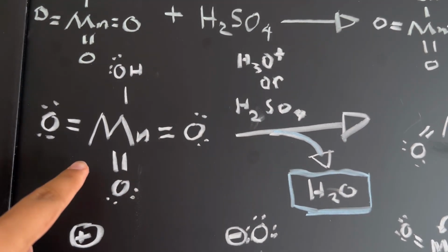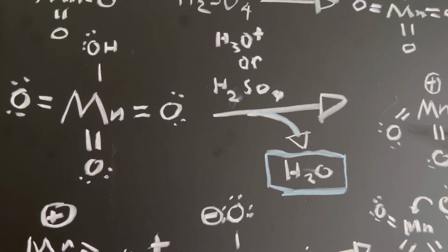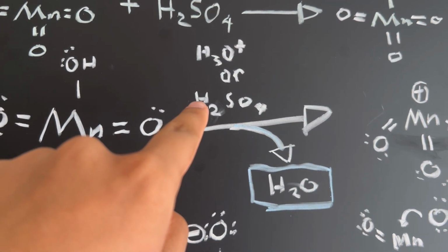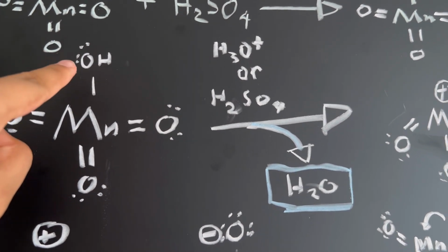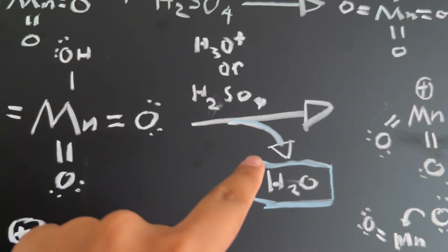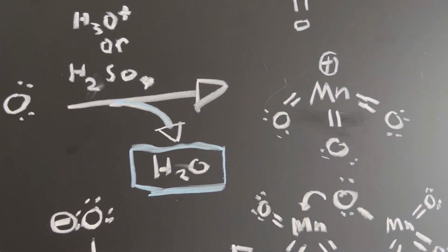Now the permanganic acid will then react with excess sulfuric acid, and it's actually very similar to nitration, how the hydrogen from the sulfuric acid or the hydronium will collide with this group right here and it'll create water. And what will happen is that water will then kind of come off and create this product right here, the water, and then it'll also create this molecule as well.